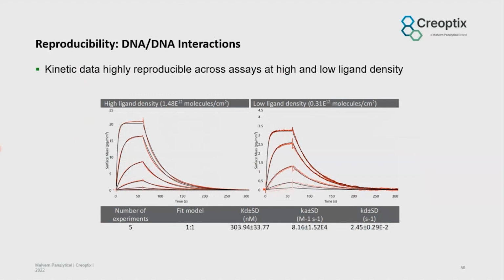Here our assay details are a 10 nucleotide single-stranded DNA biotinylated ligand captured on the surface of our sensor chip via streptavidin-biotin capture. The complementary 10 nucleotide single-stranded DNA analyte was injected in duplicate at concentrations from 4 micromolar to 0.2 nanomolar. What we can say here is that we have excellent kinetics that fit a simple one-to-one interaction analysis.